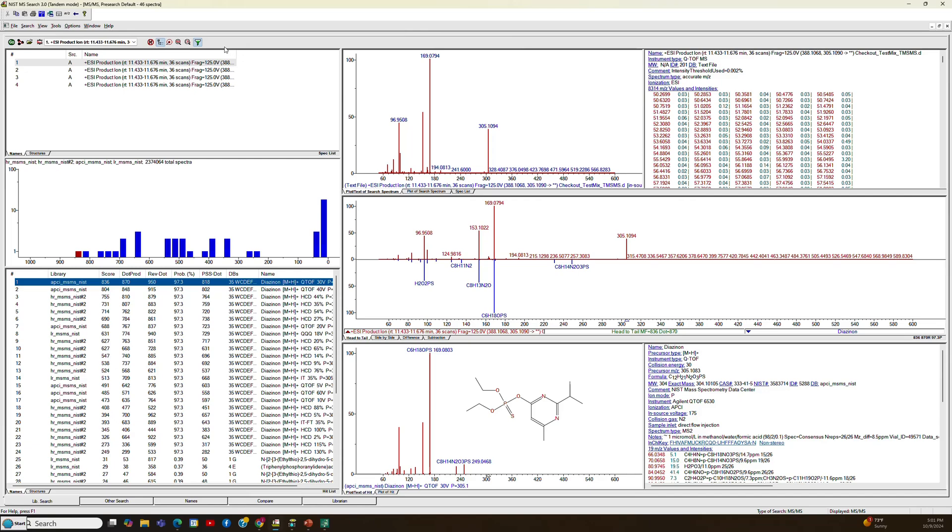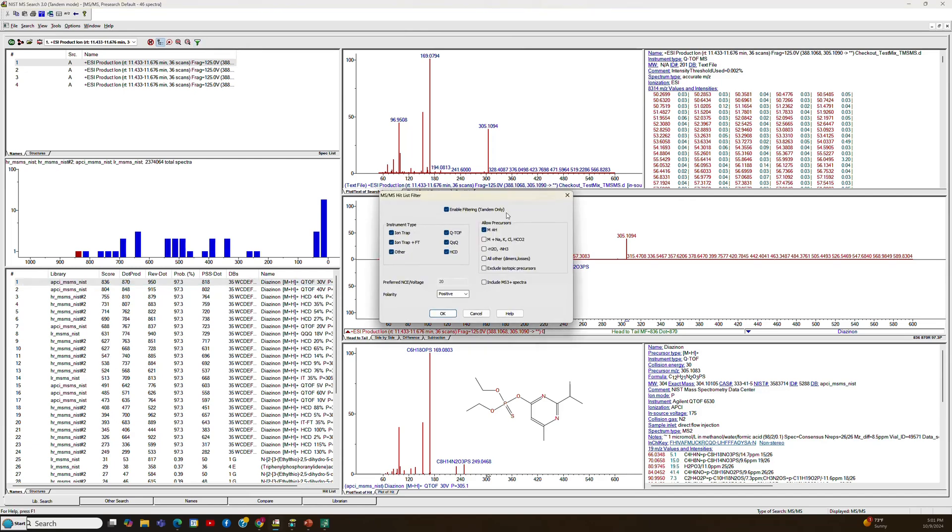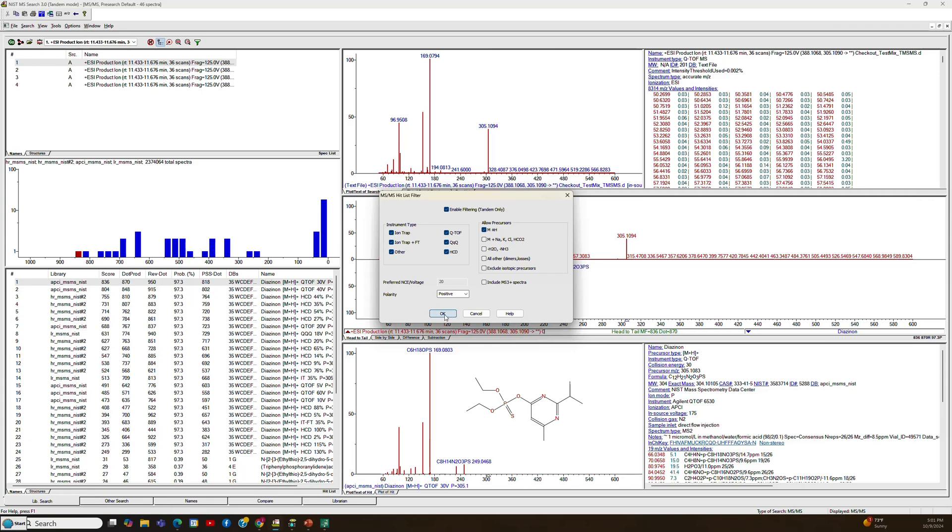There's another thing that you interact with a lot is this funnel up here. And that allows you to filter a lot of things, enable filtering of your searches such that you only see M plus Hs or other type of ion adducts. Or you can include MS3 spectra that might have a fragment ion that's refragmented and matches your structure. You can also specify the polarity, the type of instrument, et cetera.